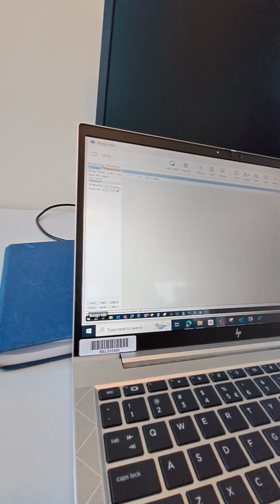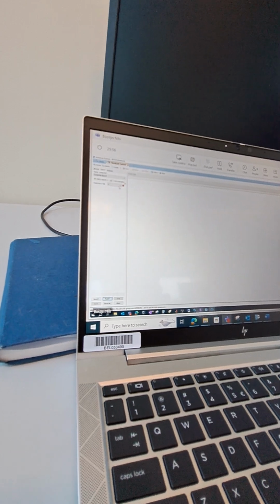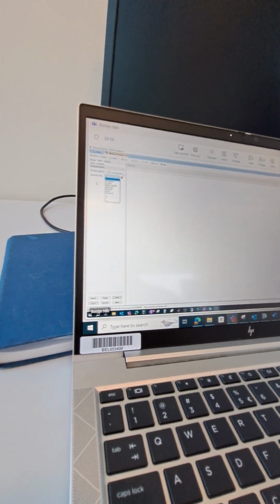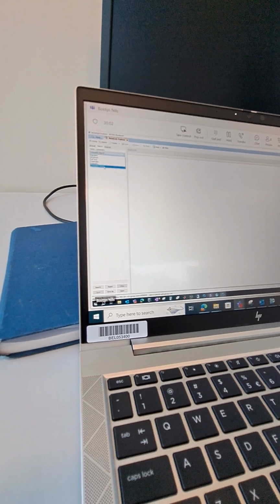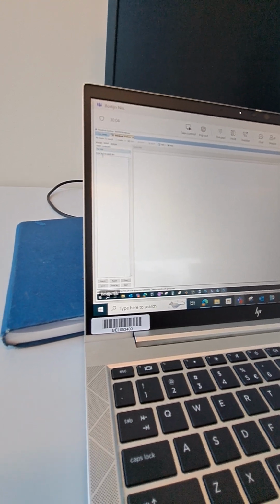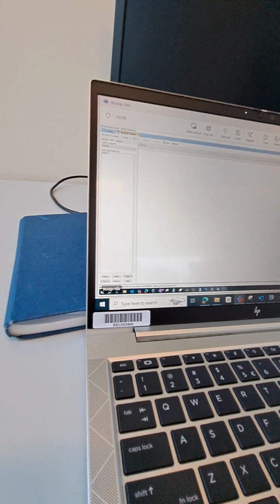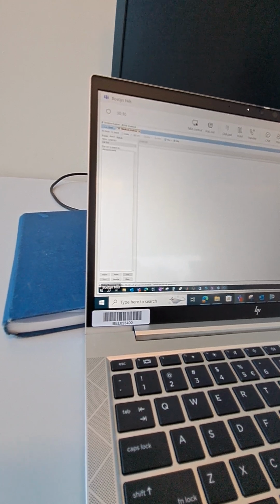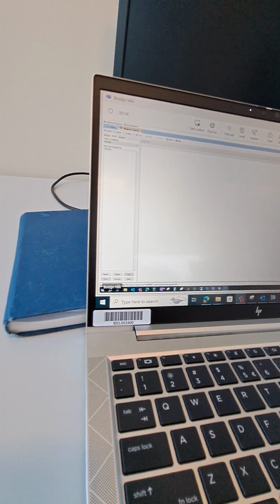But I don't use this a lot. There is full text, or here you can write this. Oh, it's a difficult word.